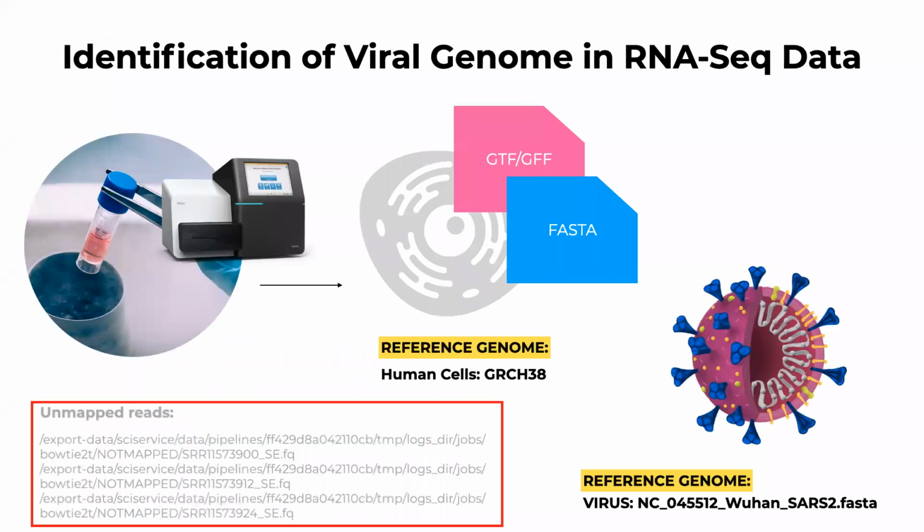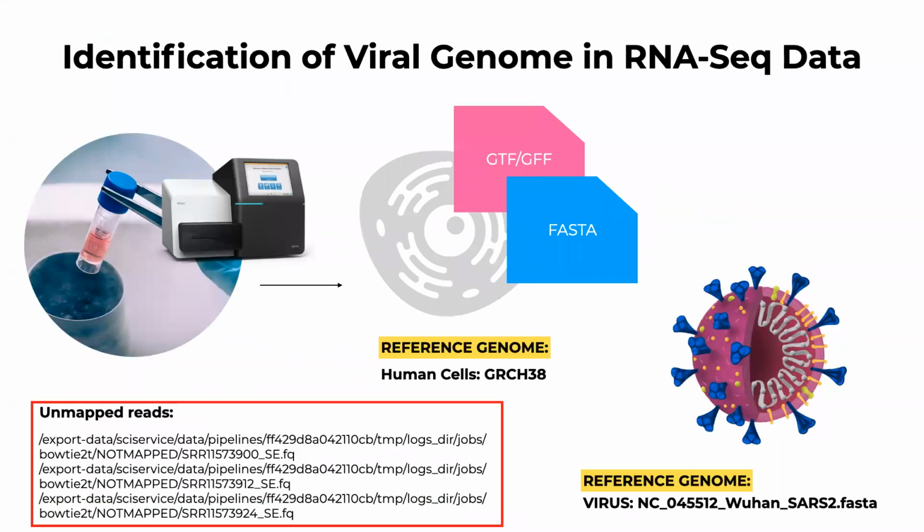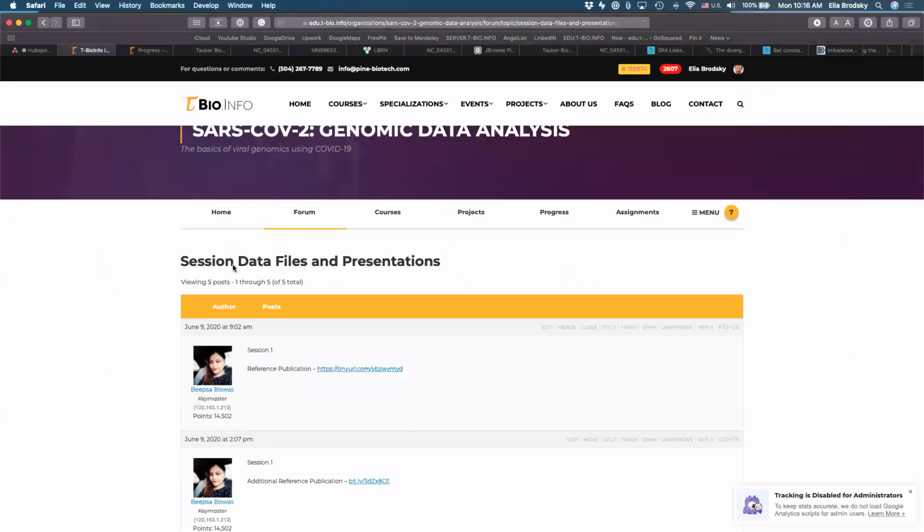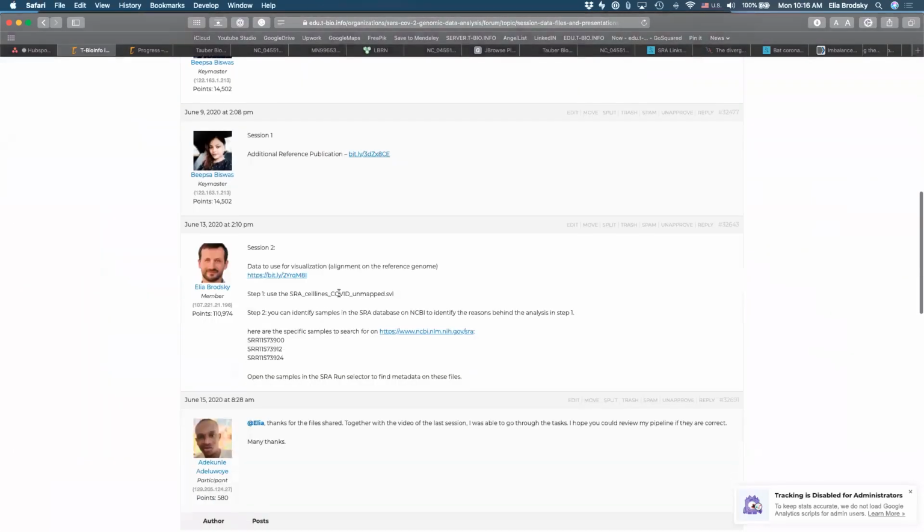Okay, so we have this process that we described last time. A biological sample is taken. Okay, Abilash is saying, I don't have access to these files. So again, Abilash, have you seen the forum? Let me show you where to find it. Okay, so this is the post.